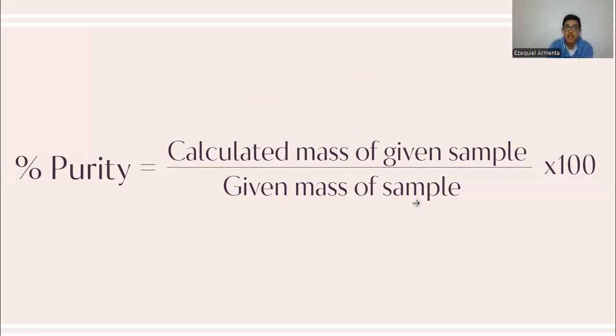The first one is UV-Vis spectrophotometry, a rapid, non-destructive, and cost-effective monitoring way to identify beta-carotene peaks in real time and estimate its purity. And the HPLC, which offers high resolution, sensitivity and reproducibility, making it the most accurate method to determine purity with the formula that is above.